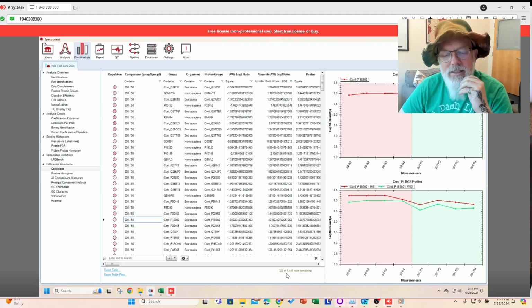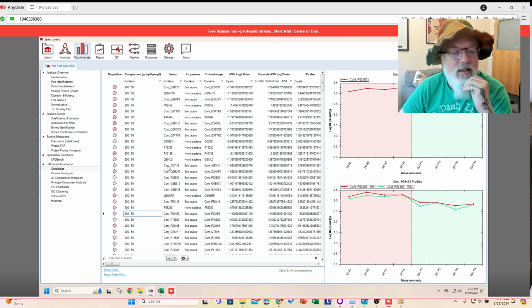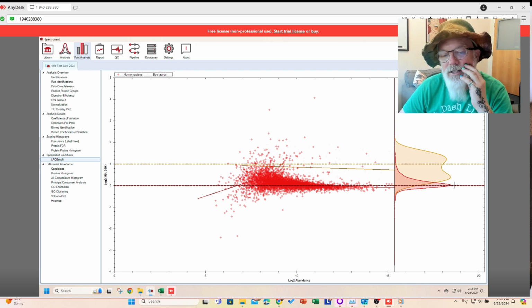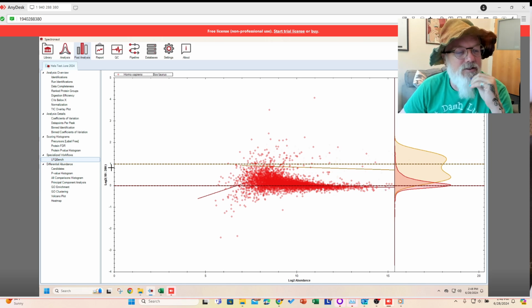You can see the candidates decreased. If you go back, it was like 500, and now there's 300. All right, so let's go look at the LFQ bench again. Okay, so maybe it's a little more centered on 0. That's what you would expect if the normalization's working the way it should. And again, 4x difference is probably a little too much for the normalization.